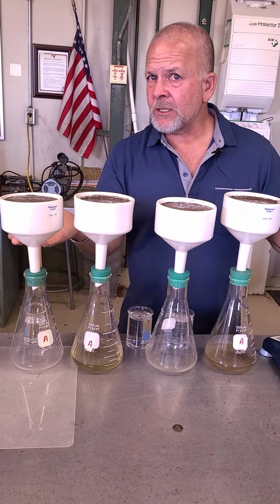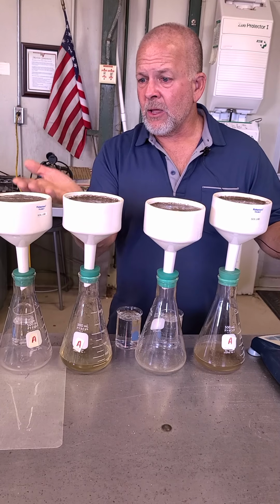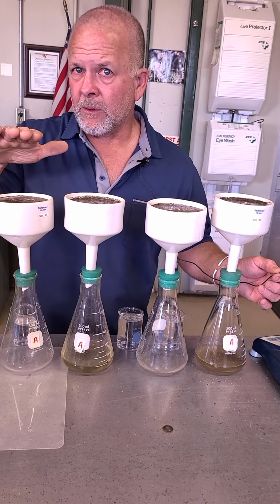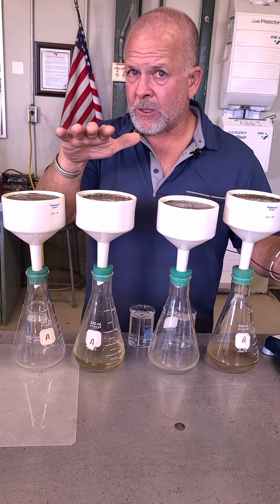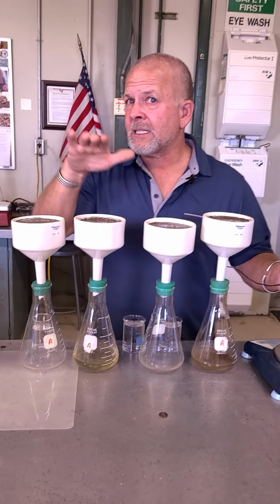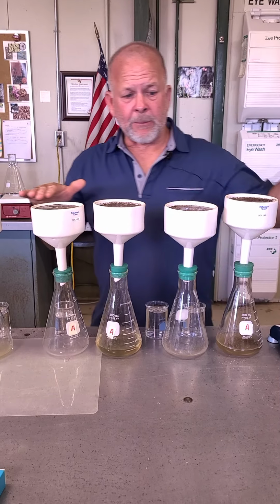So to remind you, the same thing is going on in each one of these soils. The only difference is the amount of calcium and sodium in the soil. The soil textures are the same. The amount of soil that we put in the sample was the same. It's just the salt content and type that's different. So we're going to let this run for a little bit, and I'll go down here.